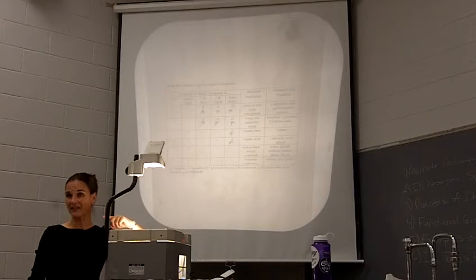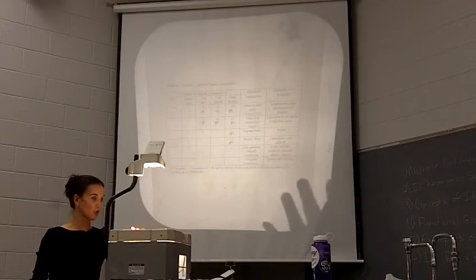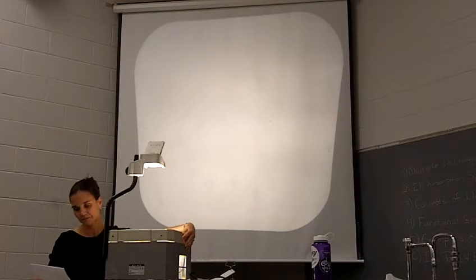With sulfuric acid, if it reacts, it's soluble, okay? So if it turns yellowy, sometimes almost orange in color, and the drops of unknown that you put in there have disappeared, count that as soluble, because it has now reacted with the acid, okay? All right, so make sure you follow that table for the solubility properties.